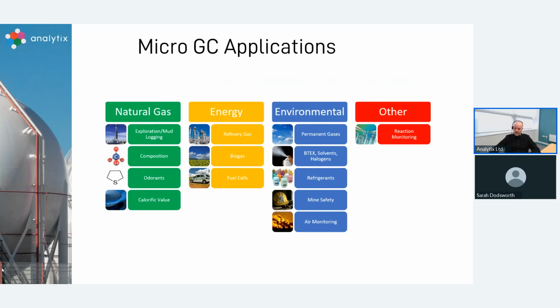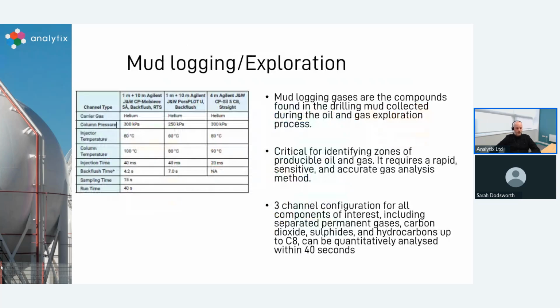Essentially anything where you're looking to do the analysis of single or multiple components of gas can be considered here. One of the applications that I'm going to look at is this mud logging exploration application. There are obviously a lot of compounds found when people are drilling as part of the oil and gas exploration process, and it's critical to identify the most producible zones for oil and gas.